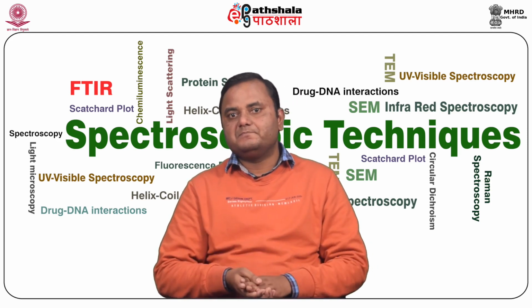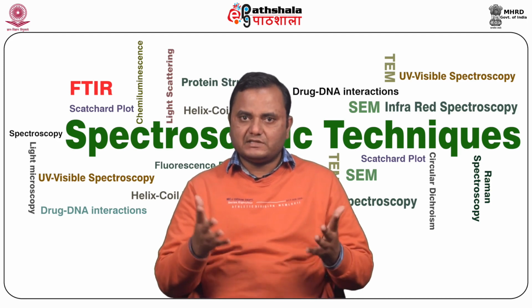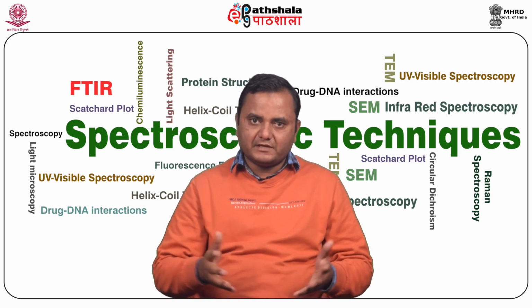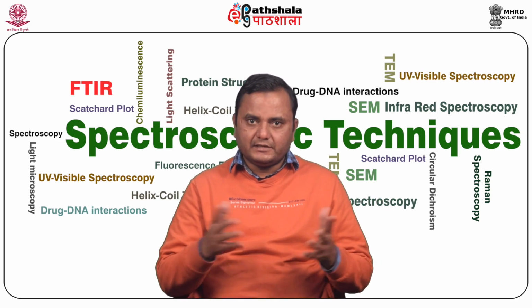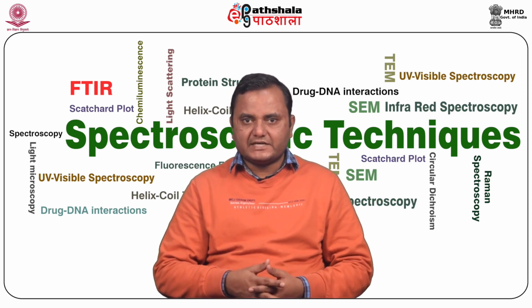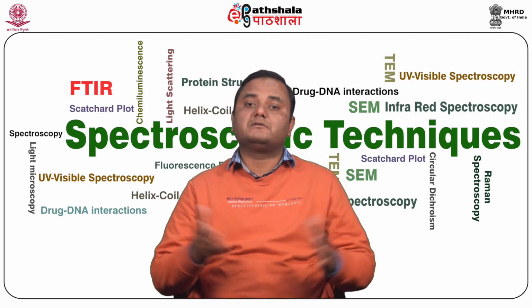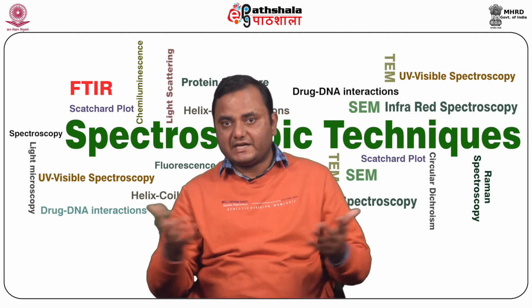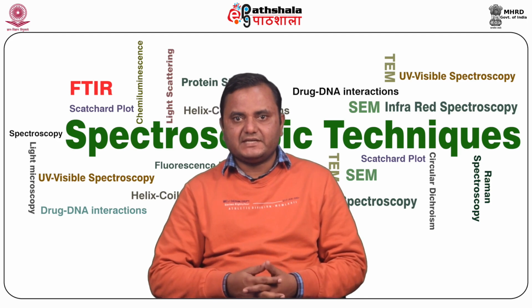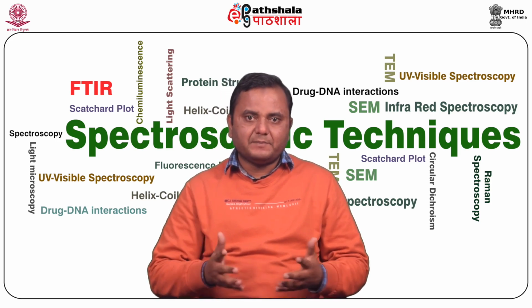Then the fluorescence method is also used for spectrofluorimetric assays based on labeling of the nucleus, the Golgi, the lysosome, endoplasmic reticulum, mitochondrion, cytoskeleton, and membrane. And it is also used for molecular biology studies by labeling different types of enzymes involved in the process, such as glycosidase, phosphatase, protease, peroxidase, lipase, and membrane potential.